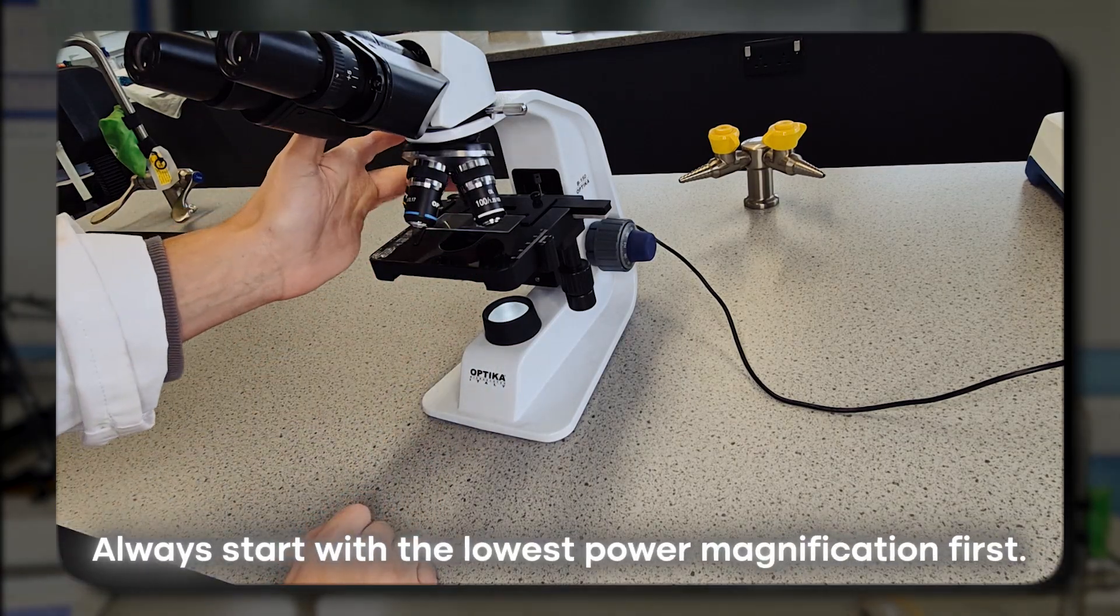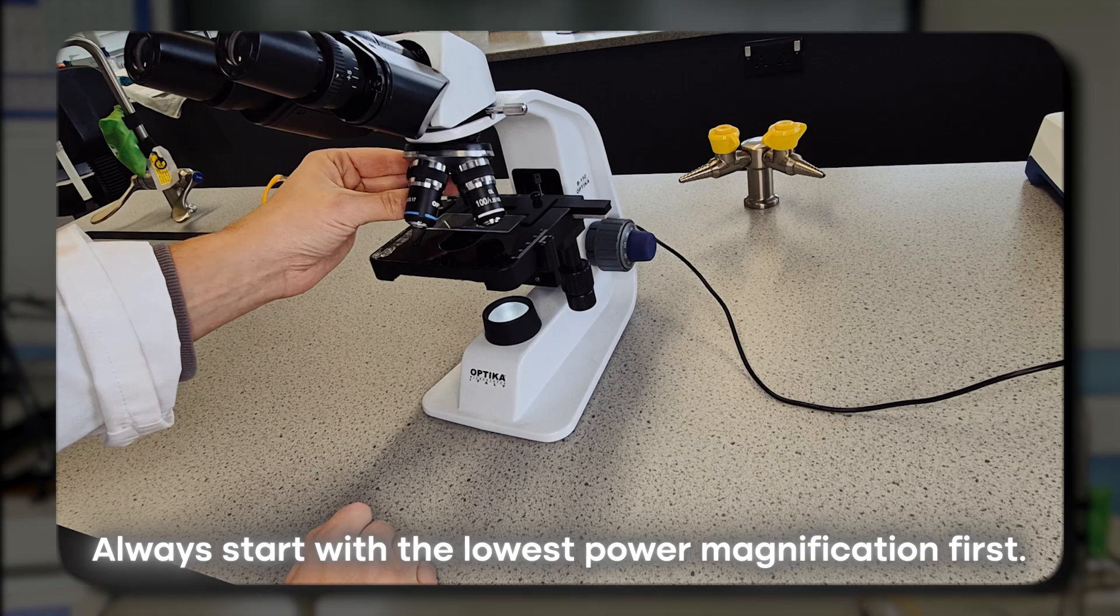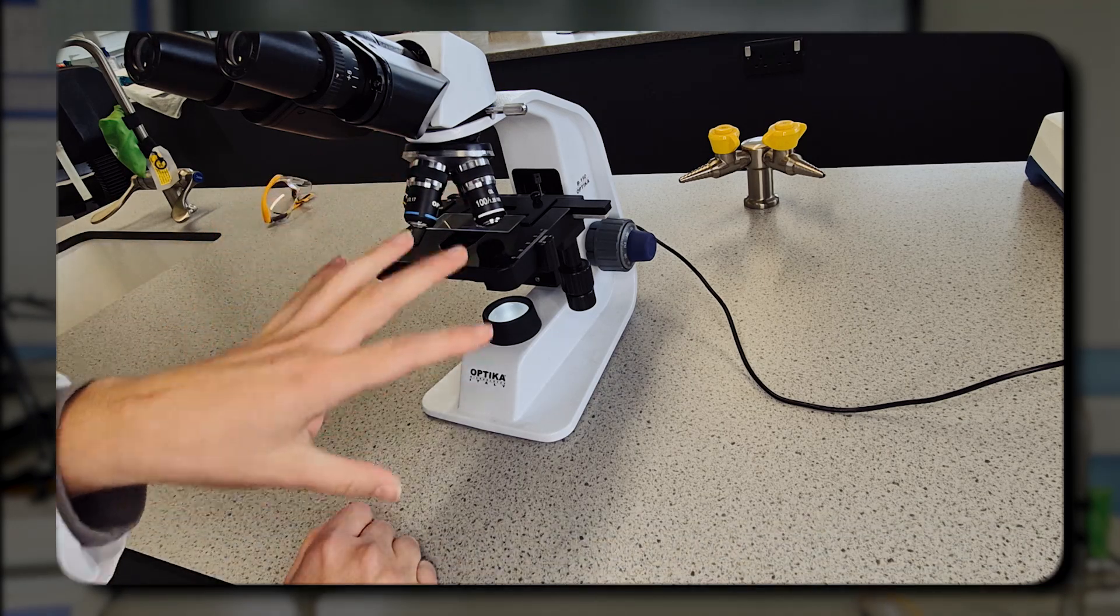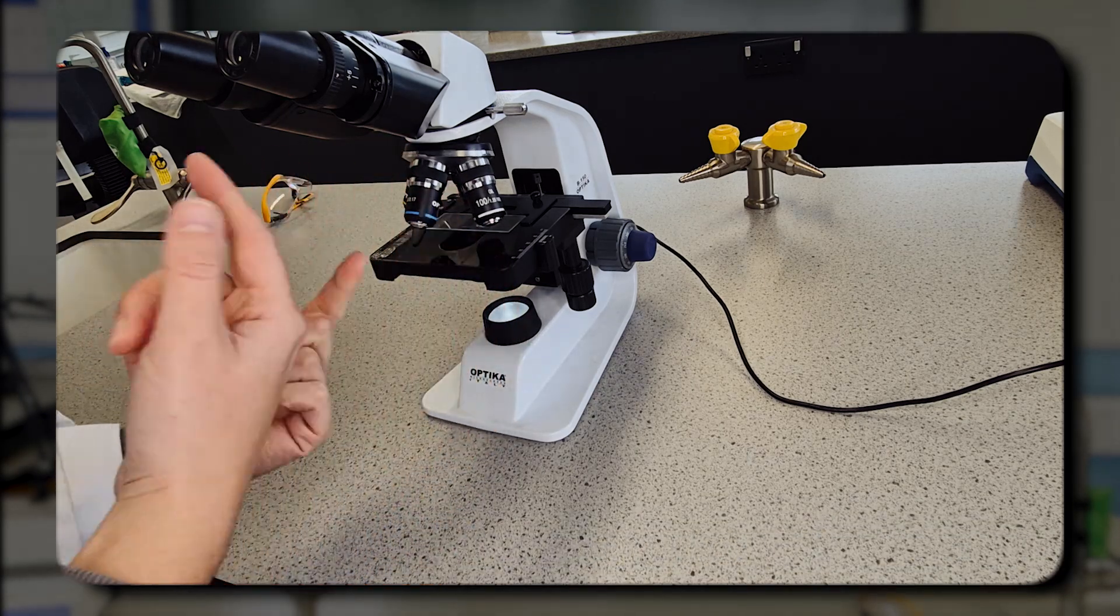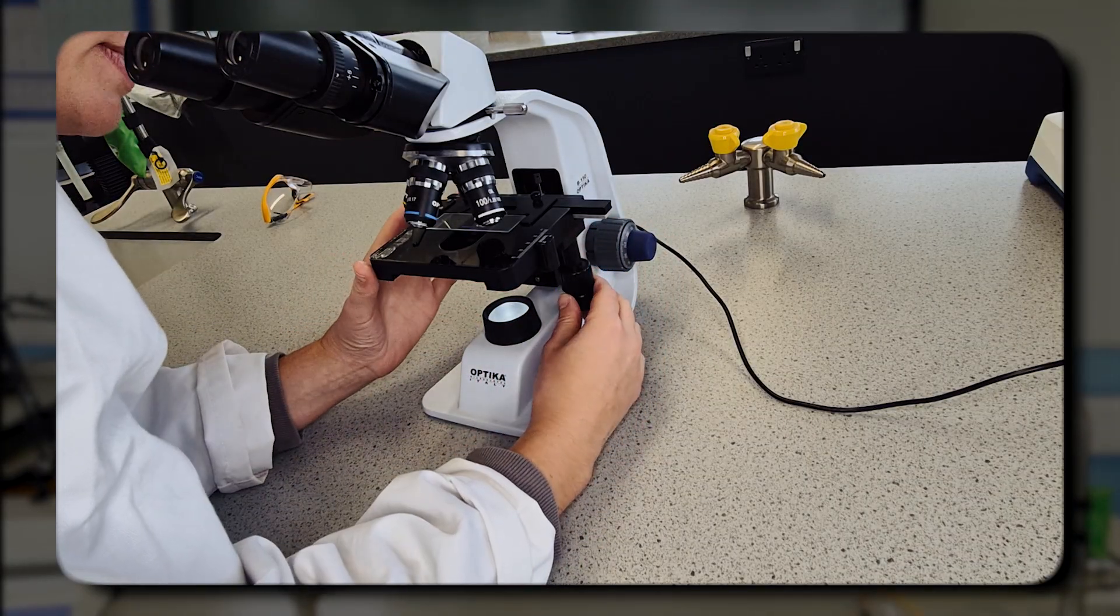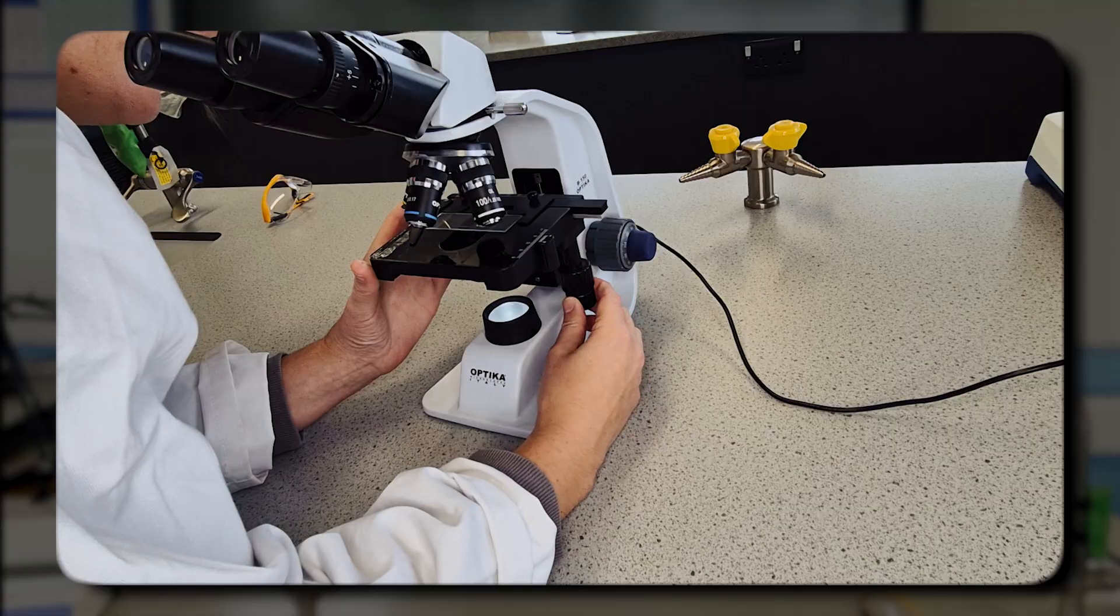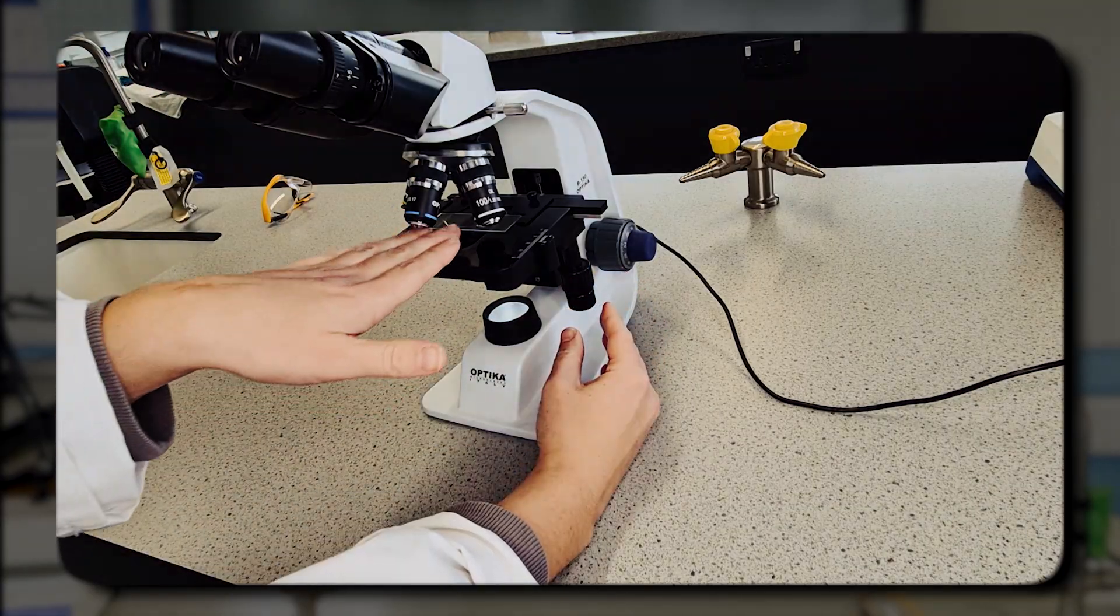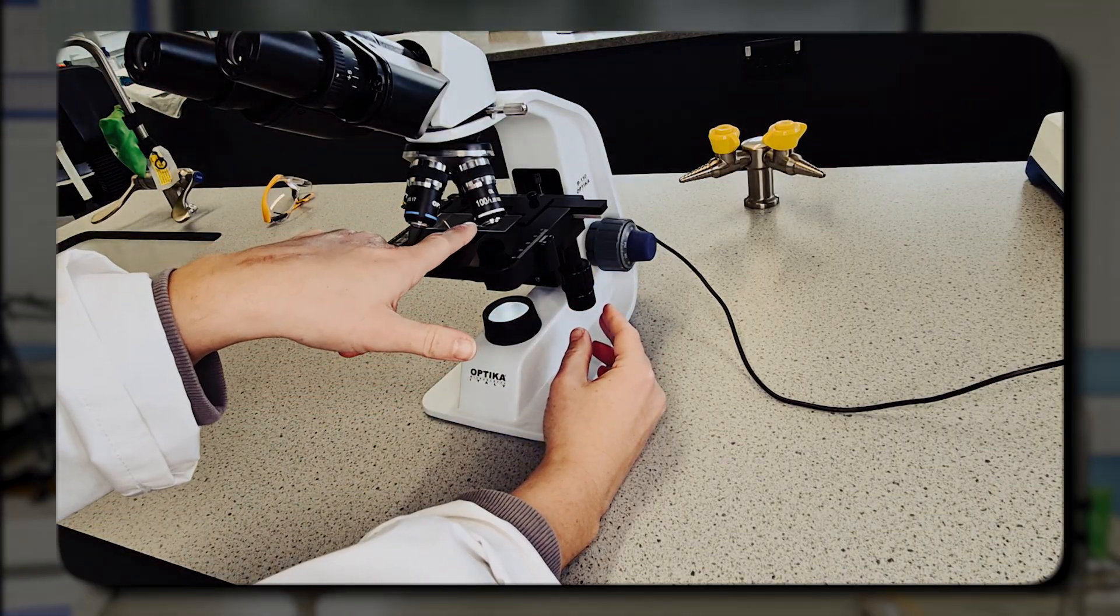Always start with the lowest power magnification first. It's easiest then to find all of the cells and then they can work their way up. Depending on what type of microscope you have, it may be the same level of sophistication or not.